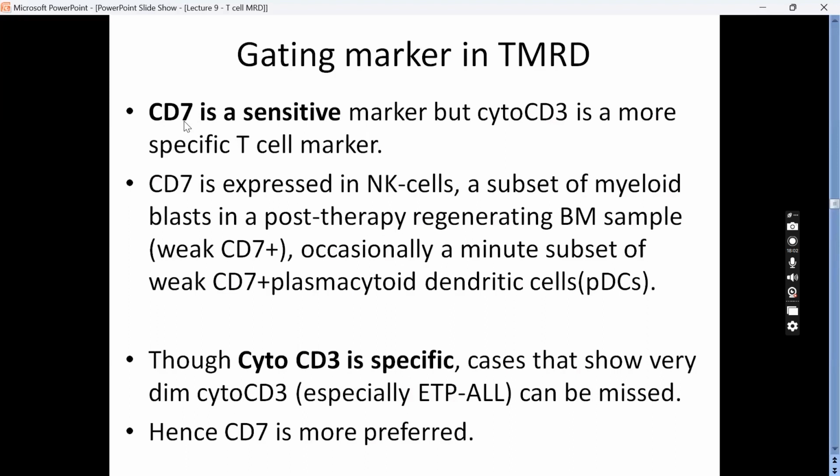Okay. Now, what is the evidence of immaturity? You do have expression of CD34, a stem cell marker, in T cells. As I said, you can call it with eyes shut that it's immature T cells or residual leukemic T cells. Now, CD1a expression: only in our diagnostic class we discussed that CD1a positivity comes in cortical type T-ALL.